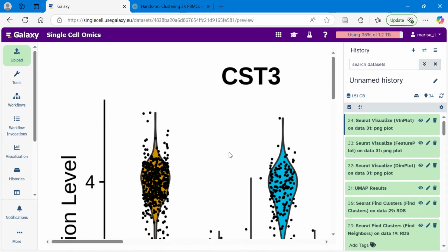So now we're going to actually try and find marker genes. There are various different tools and ways of doing this with Seurat. The next section of the tutorial quickly shows us different ways of finding markers. Essentially a marker is just a gene that was significantly more expressed by one group of cells than another. So rather than using those genes associated with the top PCs, we can now look within the clusters that we've identified at what makes that cluster different from the rest of the cells.